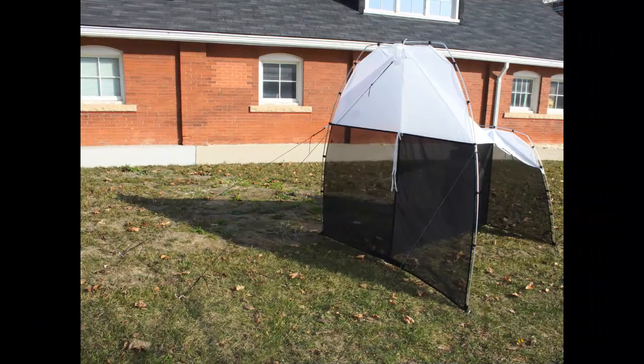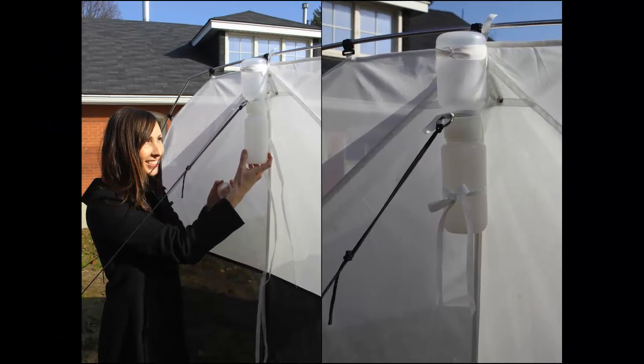The trap should now be standing upright, secure, and ready to go. To complete your trap deployment, screw a collection bottle filled three-quarters full with ethanol onto the trap and tie it securely with the pieces of rope that dangle from the trap directly behind the collection bottle.